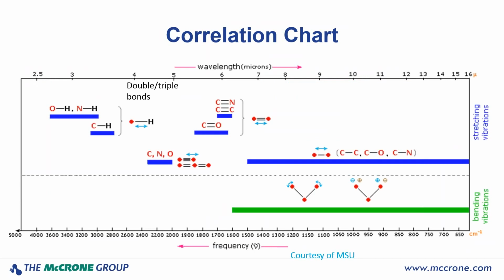Infrared spectral interpretation is based on the principle that molecular groups absorb infrared light at specific and predictable energies. So the frequencies, or wave numbers, of the bands in a spectrum can be related to the presence of certain functional groups. This predictability makes spectral searching against libraries or databases very simple. Better quality spectra are easier to search and provide more reliable matches.